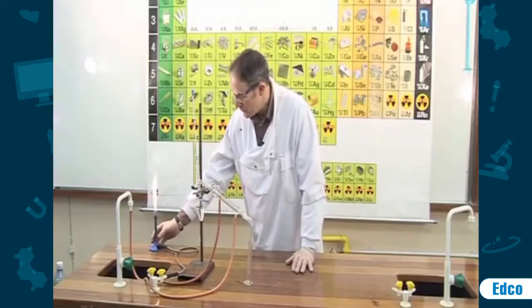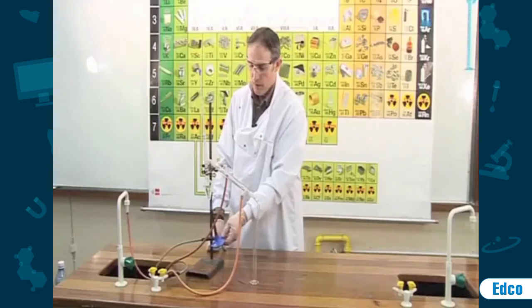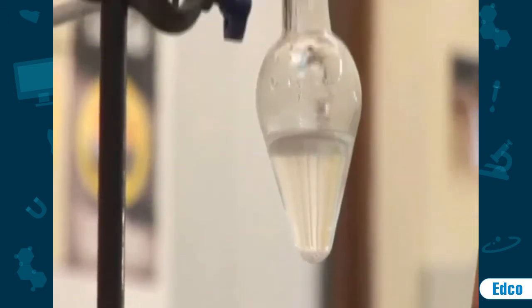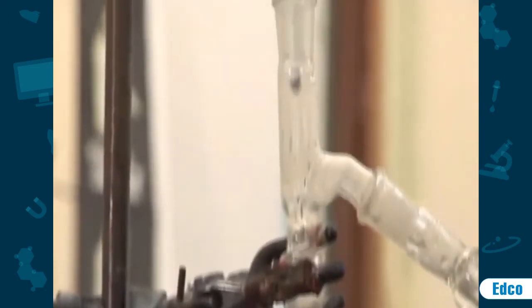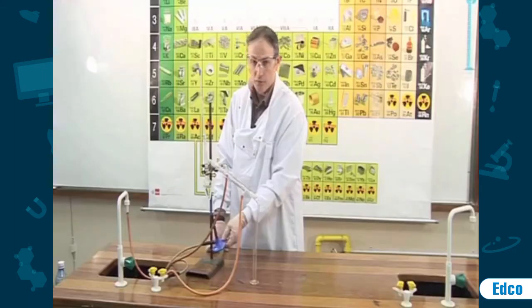We will switch the Bunsen to the blue flame by opening the collar. We will now gently heat the mixture and monitor the temperature as it rises. We do not want the temperature to reach the boiling point of water, which is 100 degrees.